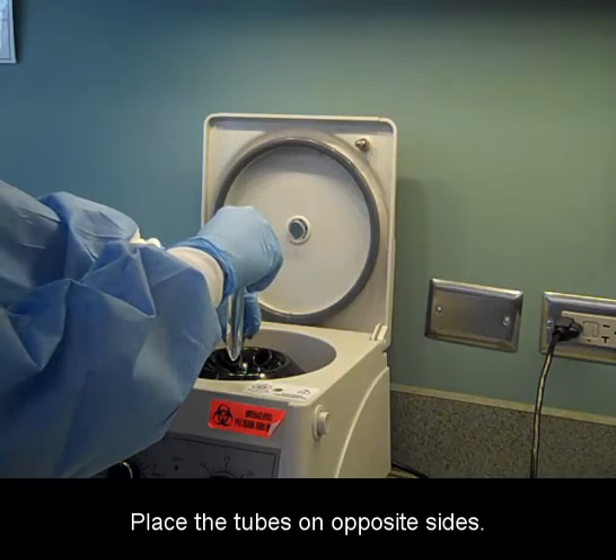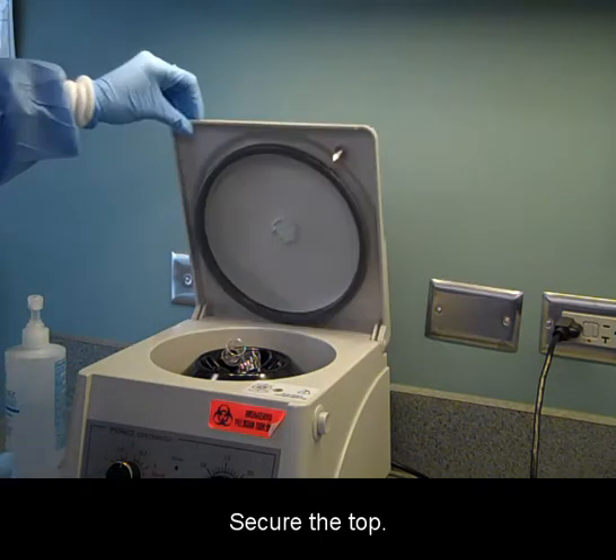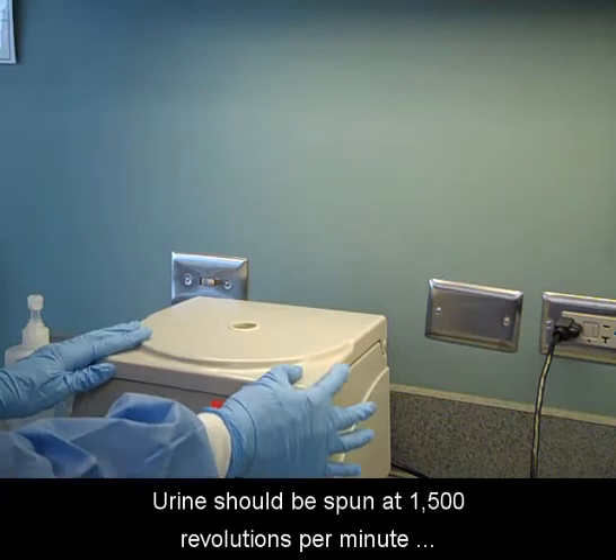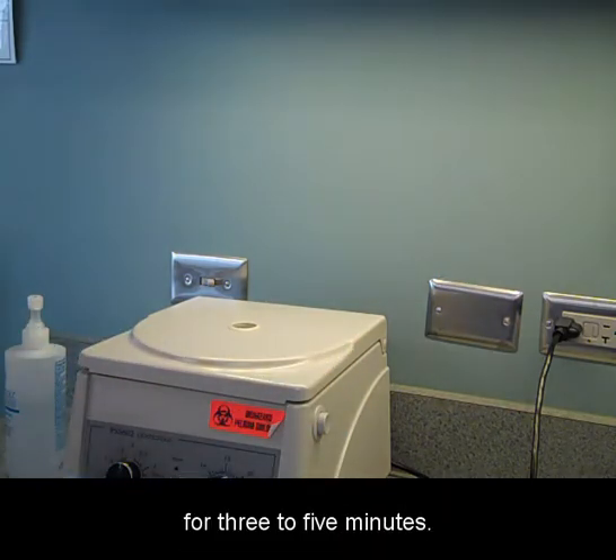Place the tubes on opposite sides and secure the top. Urine should be spun at 1500 revolutions per minute for three to five minutes.